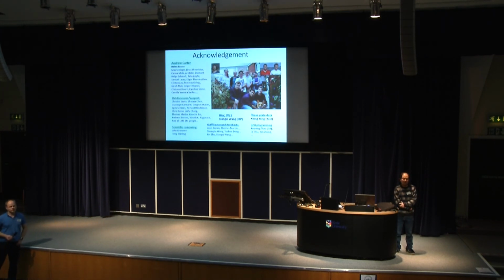Hi, I think I wasn't quite clear on something right back at the beginning, where you were talking about a systematic increase in error in defocus estimation over an experiment. But you only showed it if you increase the defocus over an experiment, was that right? What if you don't increase the defocus, the error? The reported defocus would still... You can't actually do that. That's because the defocus value from the experiment is severely inaccurate. You can't actually perfectly focus your target. It's very challenging.